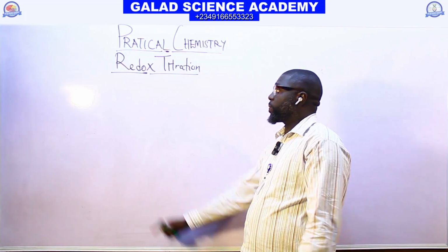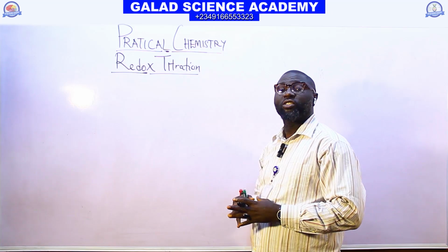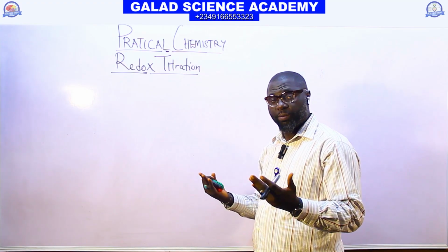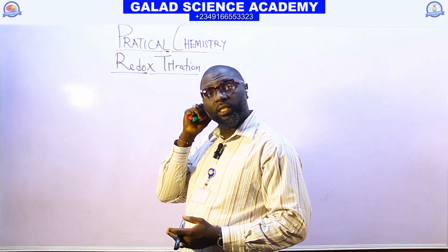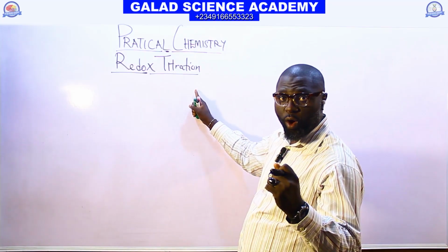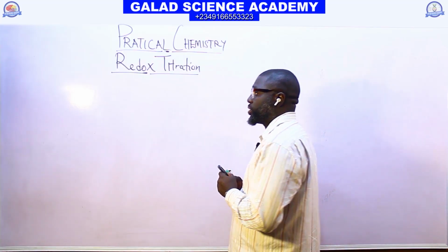The redox titration is a titration analysis which exists between an oxidizing agent and a reducing agent. That is, this kind of titration involves the oxidation and reduction reaction.